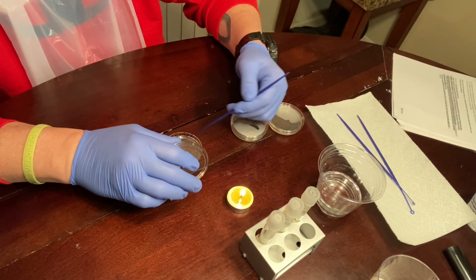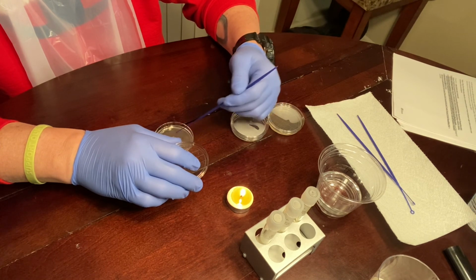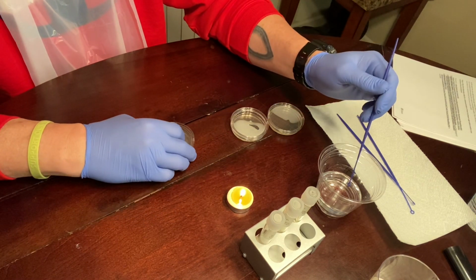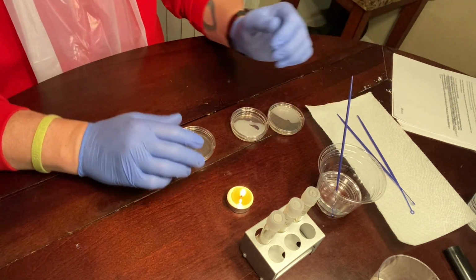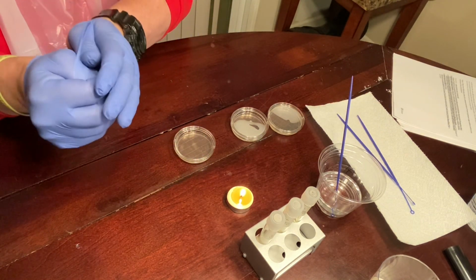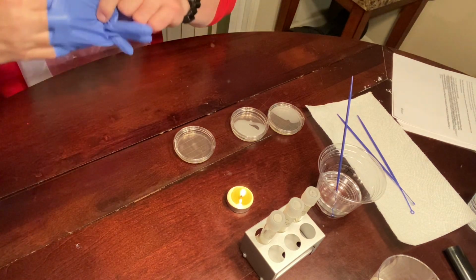And from my third quadrant to my fourth quadrant. And that will do it for isolating individual colonies. Again, we're still in week 2.